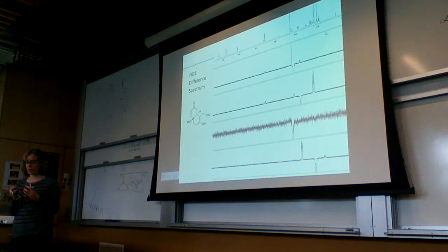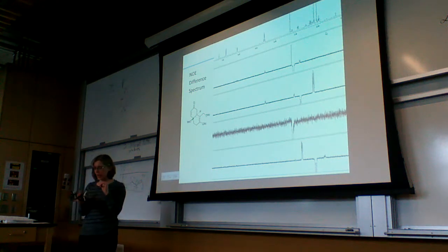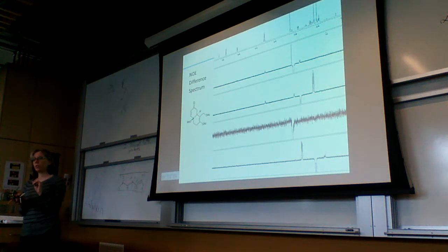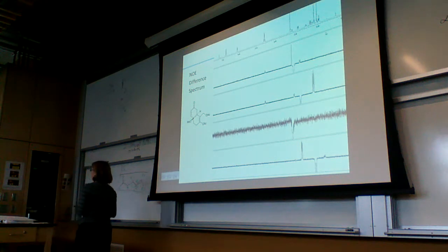See it with protons, and there is an experiment called the NOE difference spectrum, which looks at how close two protons are in space. Now, we're not talking about if they're bonded to carbons next to each other or something like that. We're talking about when you build out the whole molecule, how close are those protons in space? So the NOE here is a through-space interaction.